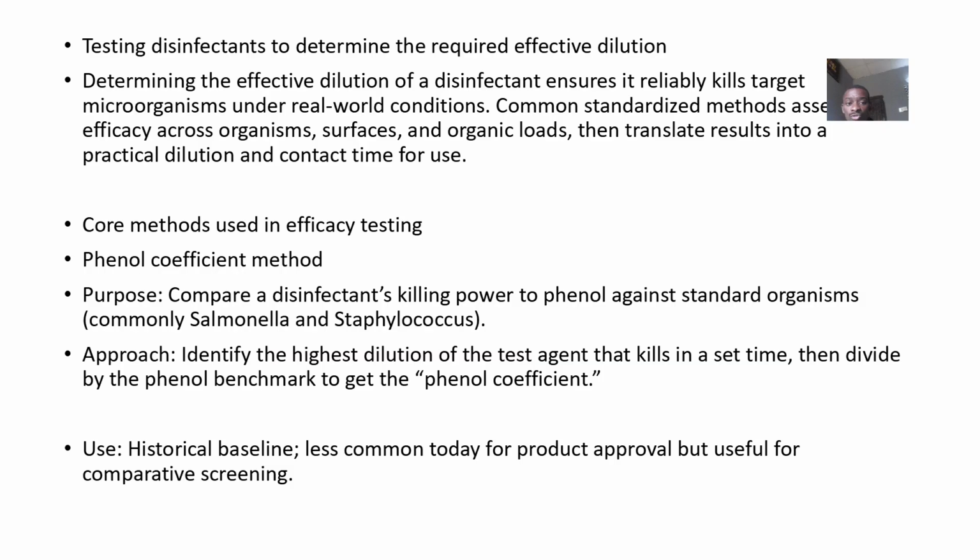Okay, so you should know that testing disinfectants to determine the required effective dilution is just to ensure that the dilution of the disinfectant, when you use it, should be reliable enough to kill the microorganisms that you want to use the disinfectant against. Okay, so common standardized methods used in determining the efficacy of a disinfectant against microorganisms, surfaces, and organic loads are as follows.